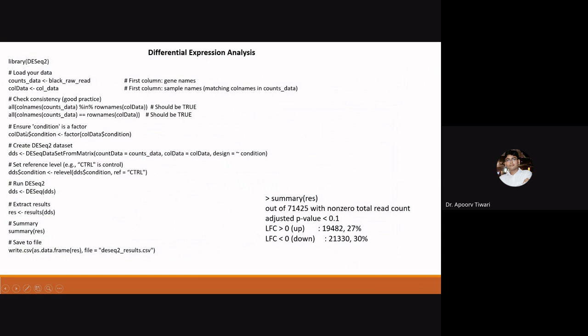After that, we set the condition to a factor. There are some character values in our files, so it will generate a factor. After ensuring the condition is a factor, we create the DESeq2 data set.